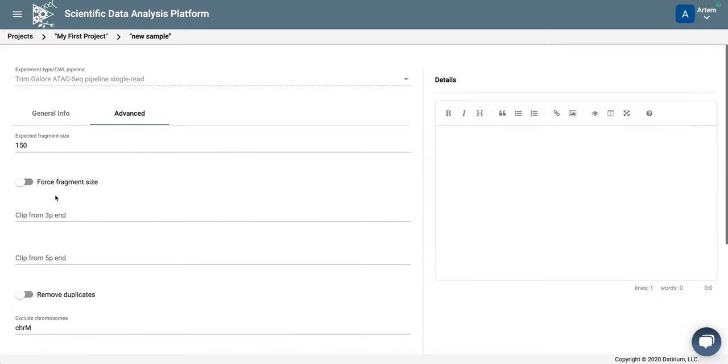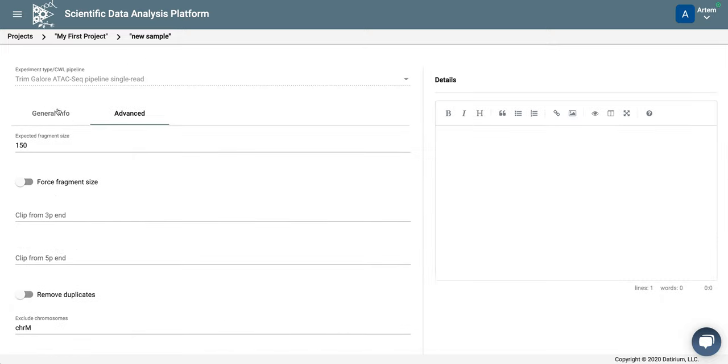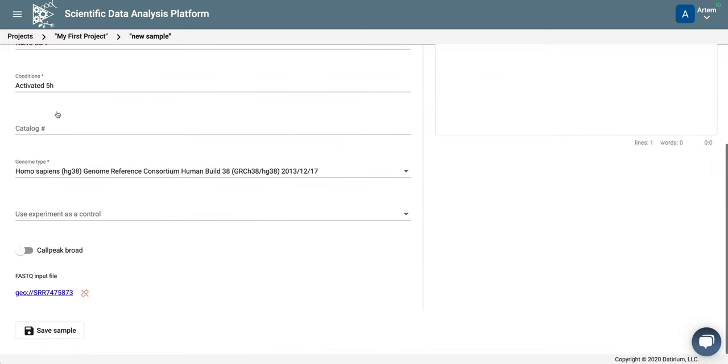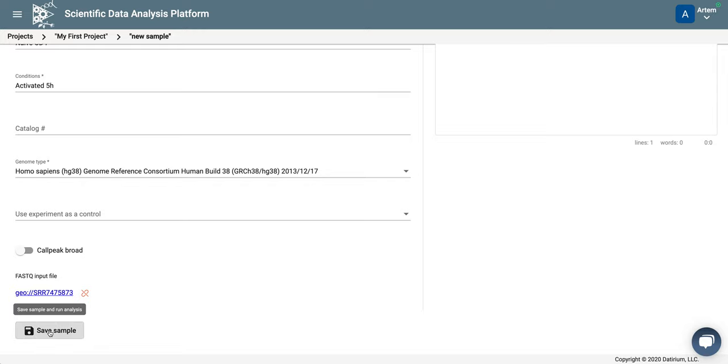Okay, now let's go back to general tab, and we click save sample, and this will start sample processing.